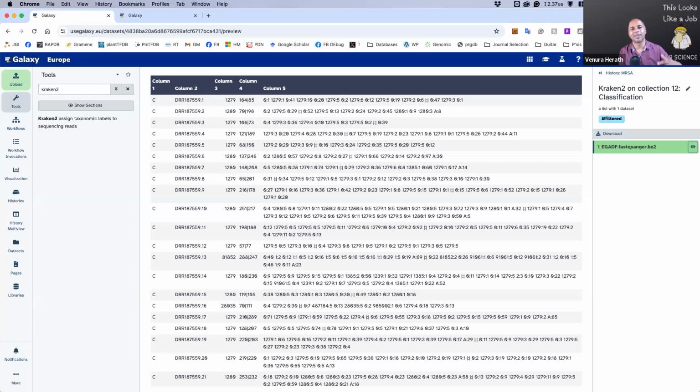And let's say we have new, unmatched things. Then we can further, not with this tool, but there are other tools that we can use for further classification or taxonomic identification of those strains or species. Okay, so shall we move forward? Let me show you the PowerPoint file.